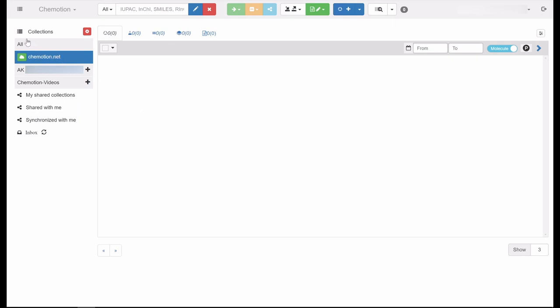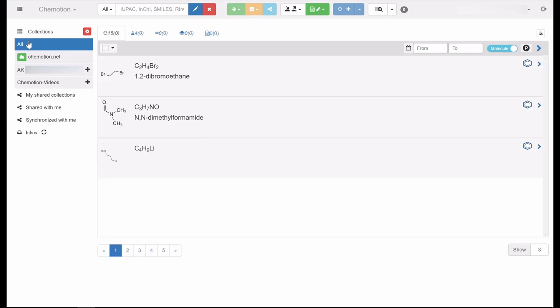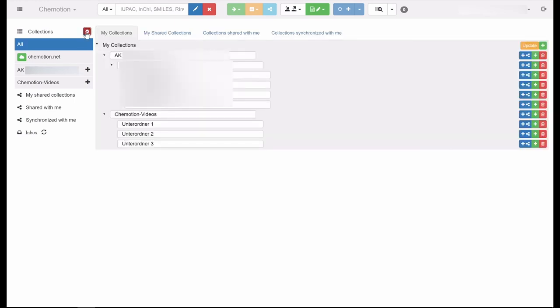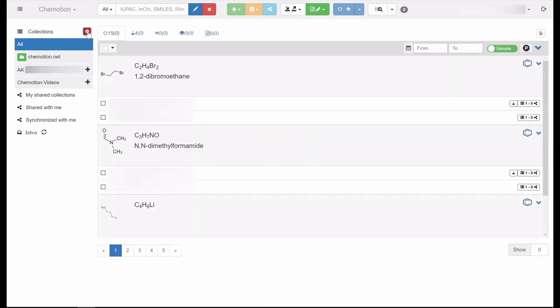Another example is the All collection, which collects every entry of all the collections present in the ELN. Moreover, you can create additional individual collections by clicking on the gear icon with the red background. To display sub-directories or folders, click on the plus symbol.